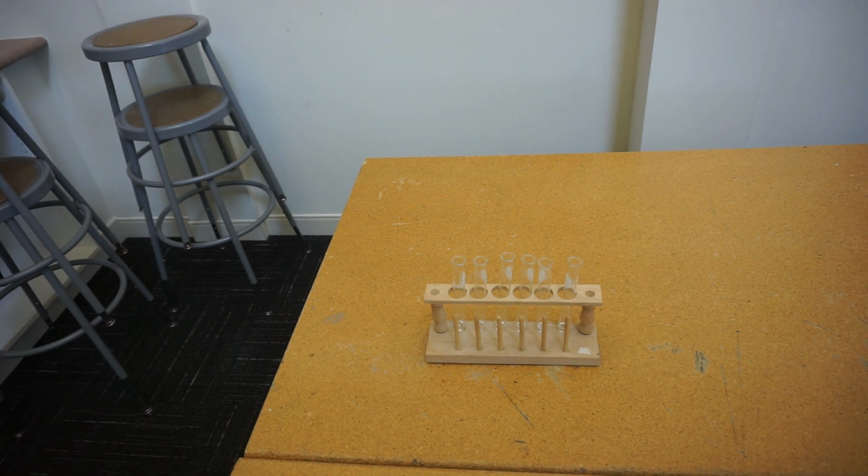Okay, once you've worked that out, you can now start to think about which ones we would expect to mix with water and which ones we wouldn't, and perhaps why. So the presentation did mention that the shorter chains should mix with water, whereas the longer ones wouldn't. And we'll talk a little bit about why not later on for some of those. But to begin with, we'll just start by adding a little bit of water to each of them and see if they do indeed mix or not.